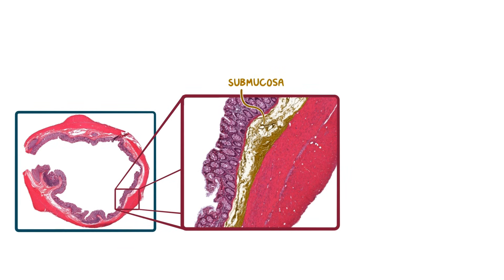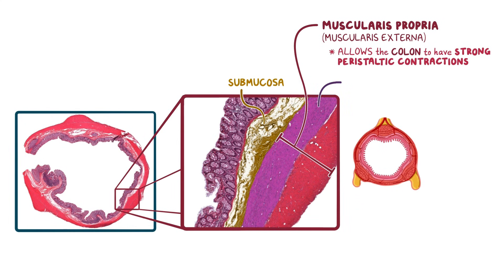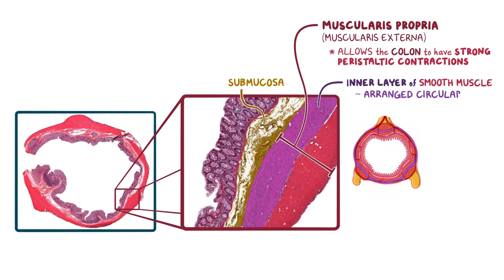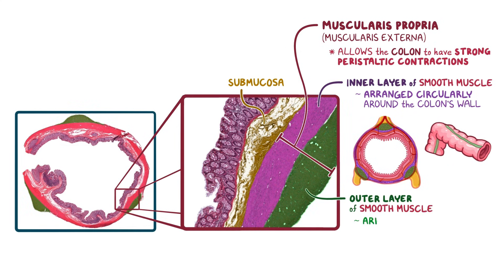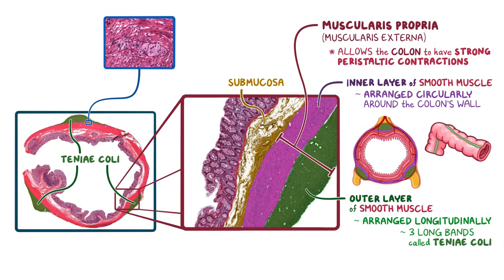Surrounding the submucosa is the next main layer of the colon wall, called the muscularis propria, or muscularis externa. The thick muscularis propria allows the colon to have strong peristaltic or wave-like contractions to help move the feces through its lumen. The inner layer of smooth muscle is arranged circularly around the colon's wall, and the outer layer is arranged longitudinally, organized into three long bands of muscle called tinea coli. Between the two layers of muscle, we can see cross sections of nerves from the myenteric or Auerbach's plexus, which is responsible for innervating the muscle fibers of the muscularis propria.